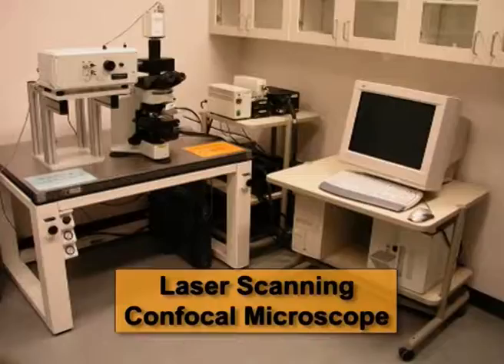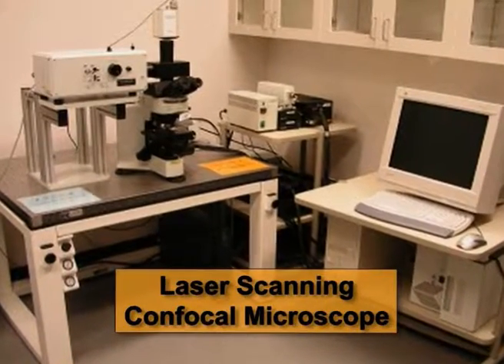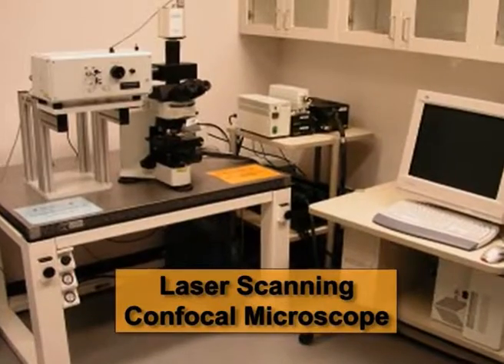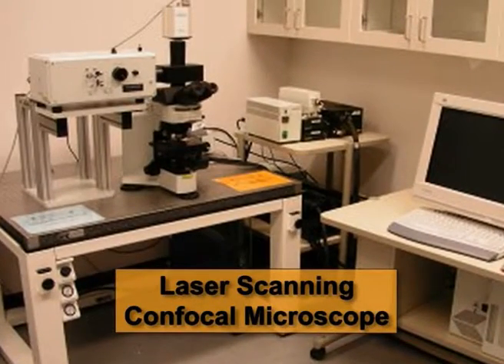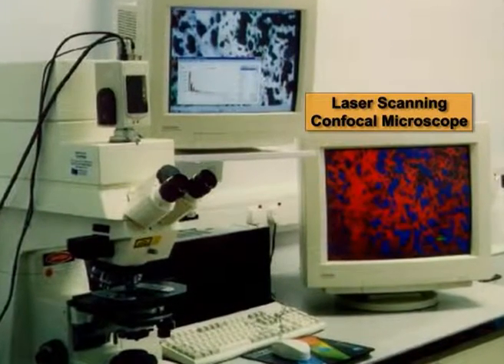So confocal is a very good example of an integrated microscopic system where, using computer software, I can actually operate the microscope. I can also control the position of the pinholes and the movement of the pinholes. I should also tell, in case of a laser scanning confocal microscope, mirrors are there which reflect light coming from the first pinhole.